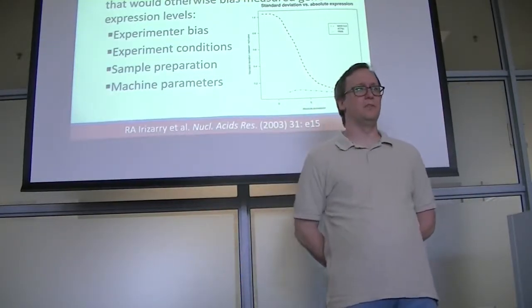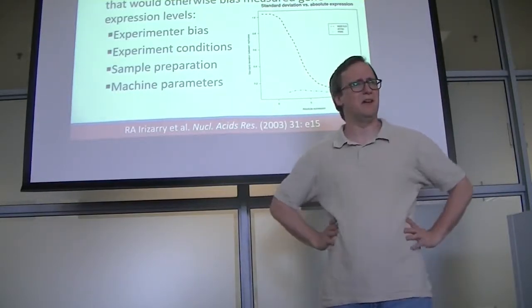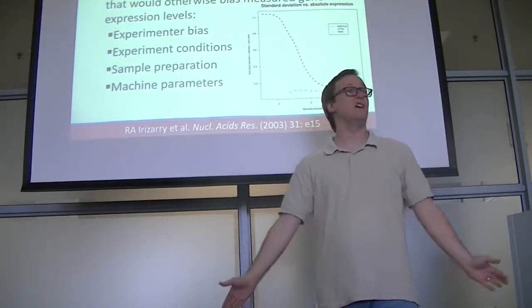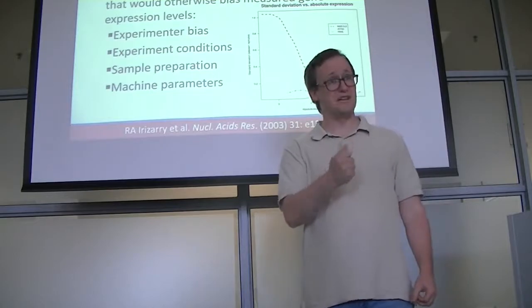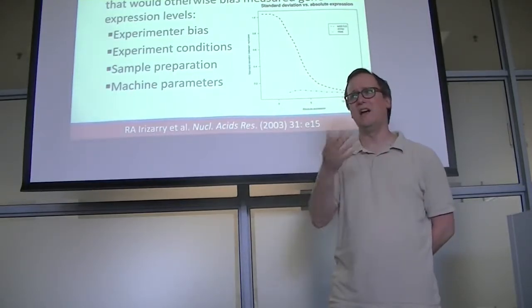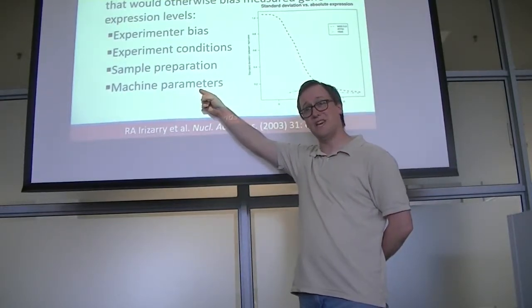All right, sample preparation. Now, if you're a professor, it's almost an industrial practice that you learn to blame the person who was handling the pipette, right? Oh, the technician must have double pipetted these, or they pressed a little too hard and they got 15 rather than 10 microliters or whatever. This is not fair, but this is what happens. You, as the person holding the pipette at this point in your lives, probably would feel particularly sensitive about that, and for very good reason. So, it is true that occasionally we have minor variations that creep into our sample handling that we wish weren't there. It happens to everybody, and so being able to detect it from our data matters.